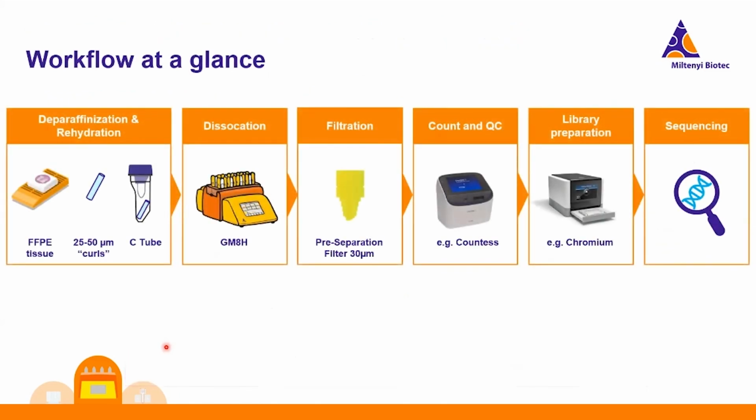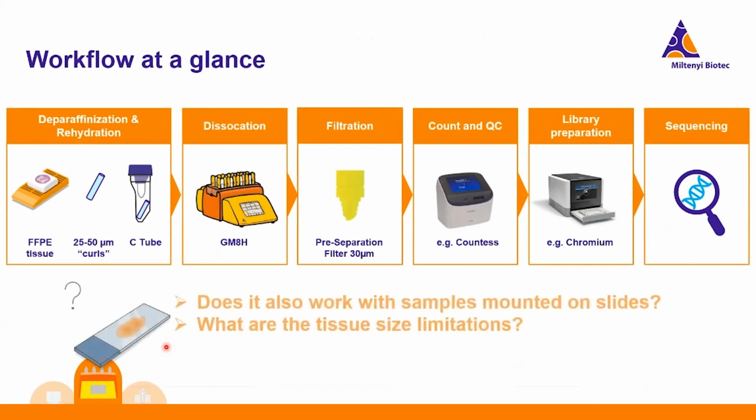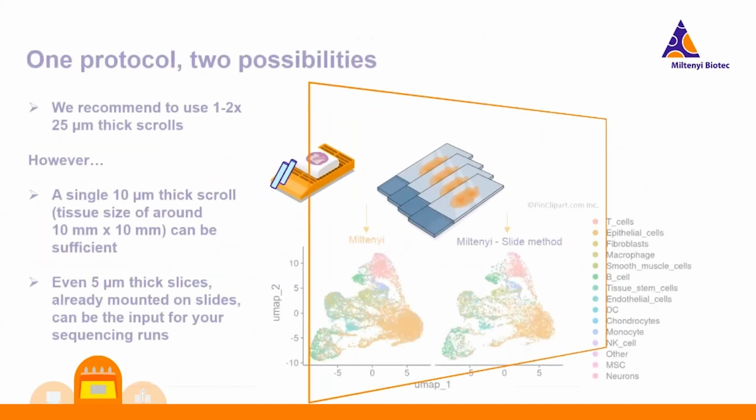Coming back to our workflow, you might ask yourself, is that also feasible for sections which I have already mounted on glass slides? And what are their tissue size limitations? And yes, you can actually do so.